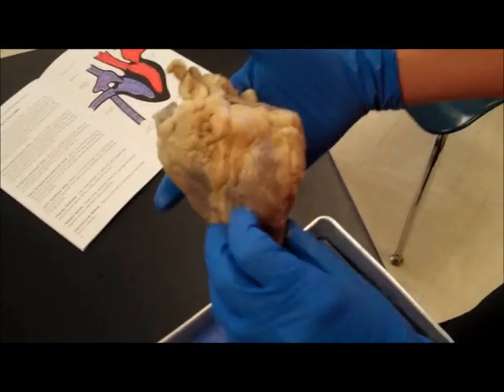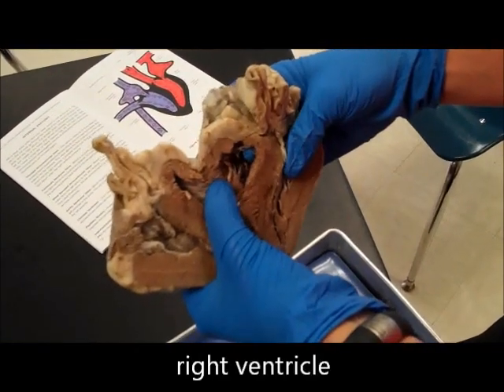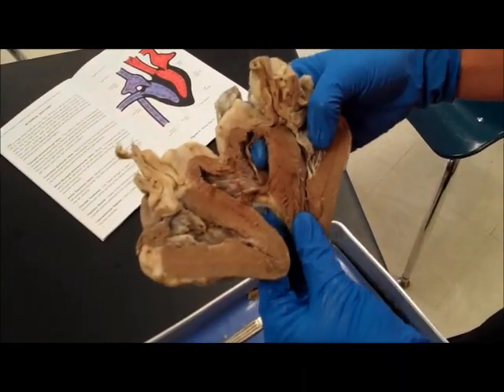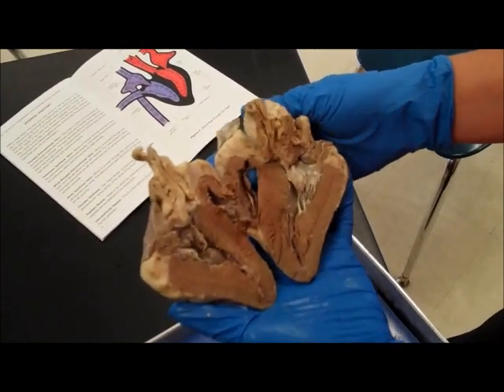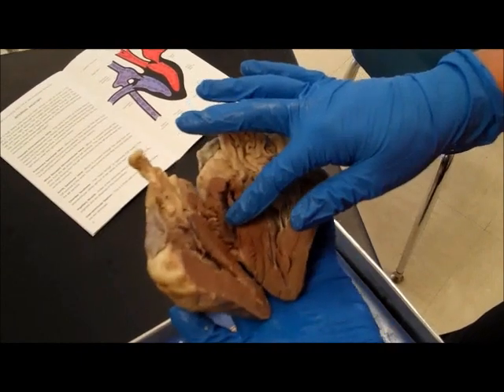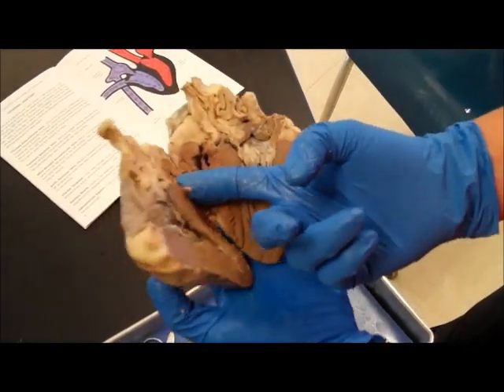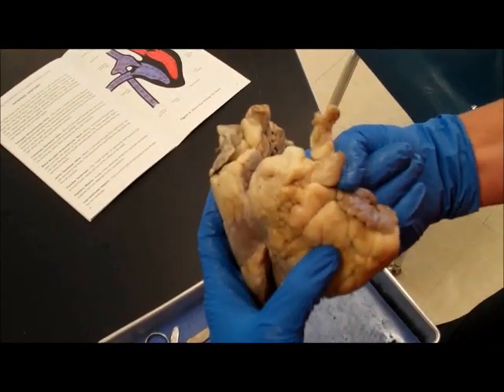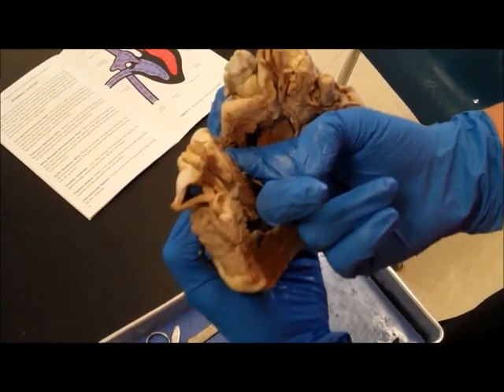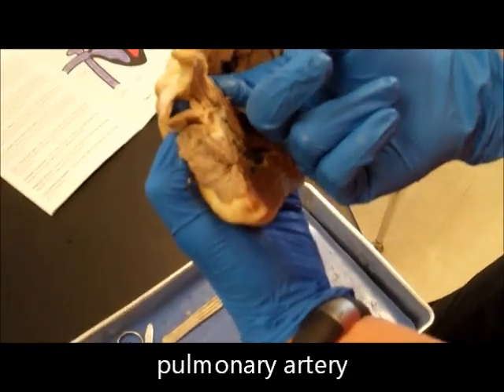We go through the right atrium. We're going to go into the right ventricle through the tricuspid valve. You can see remnants of the tricuspid valve as your finger goes through. And from this ventricle, we are going to pump blood to the lungs to become oxygenated. As that happens, I'm going to put my finger up through here as I close the heart. You can see this thick-walled vessel right there is going to be your pulmonary artery. So remember, artery stands for A, away from the heart.